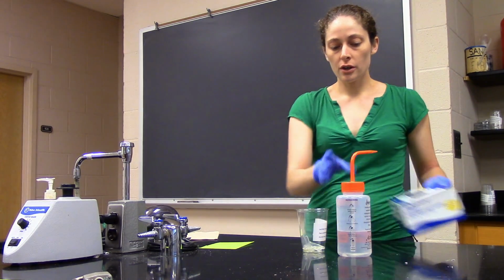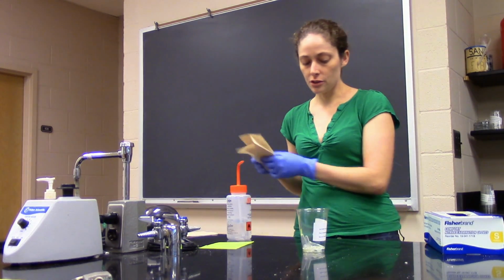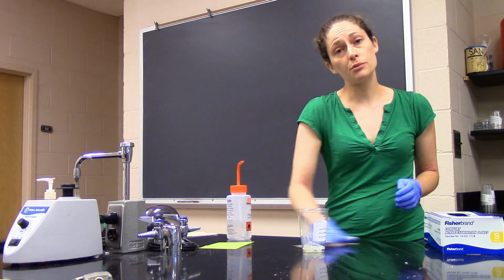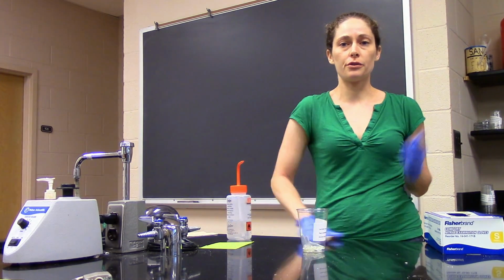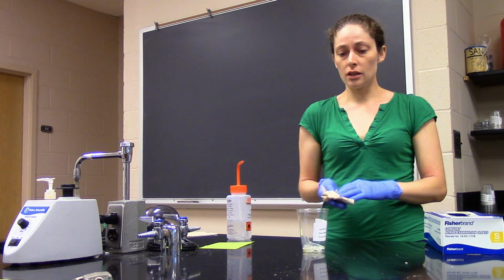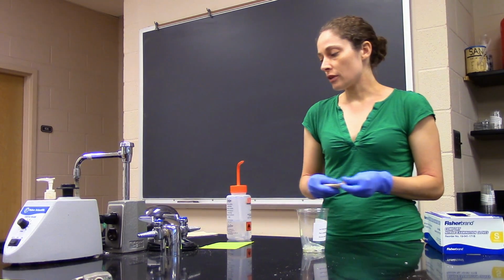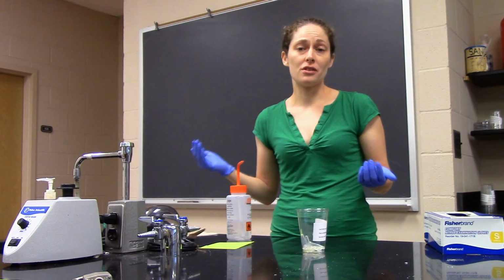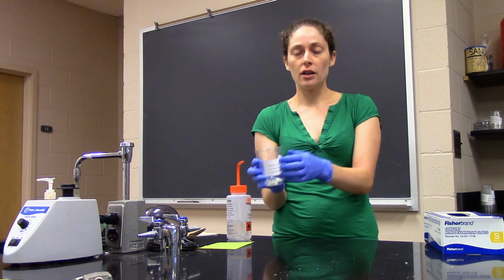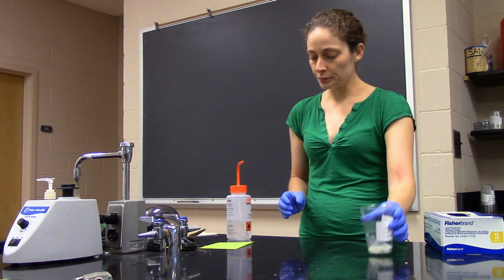Okay, so before you start working, it's a good idea to take some ethanol, spray your area with these little squirt bottles, and wipe it down with a towel to help sterilize whatever contamination might be on here from whoever was working here previously. Also, when you're done working, it would be good to wipe it down and avoid any contaminants on here from being there for the next person that'll come in. Also, along the lines of keeping your work area clean, you'll have these little trash bins. You want to empty these out at the end of every lab.